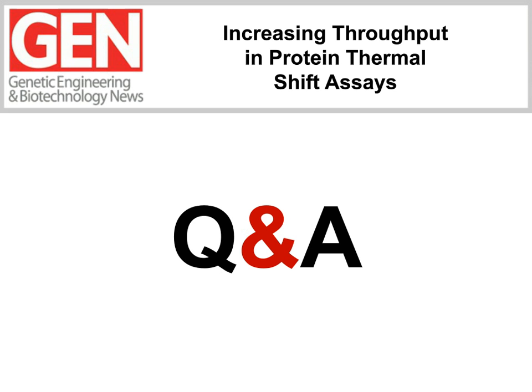All right, and our last question, I think, is a little bit similar to something you talked about before. Someone would like to know, can you slow the ramp rate to 1 degree per minute? Absolutely. You can go down to less than a degree per minute. It is not a limitation on the LightCycler instrumentation at all. The way that we built the LightCycler instrumentation is basically the block communicates to the detector.